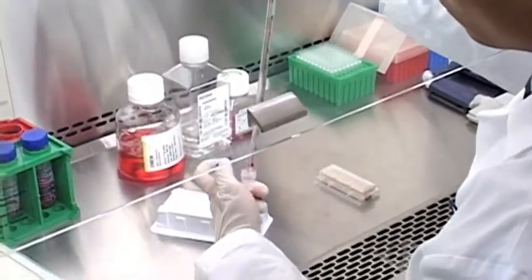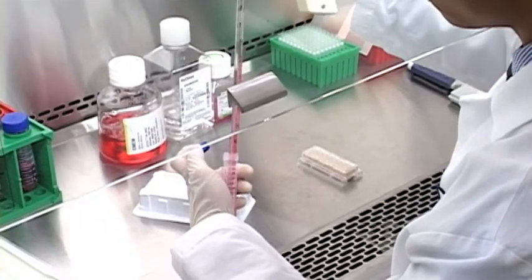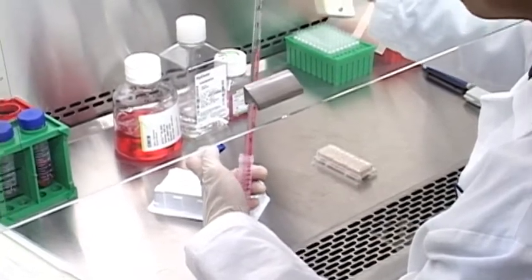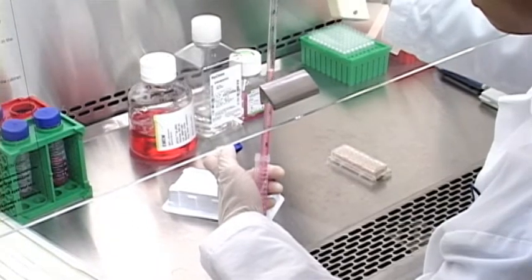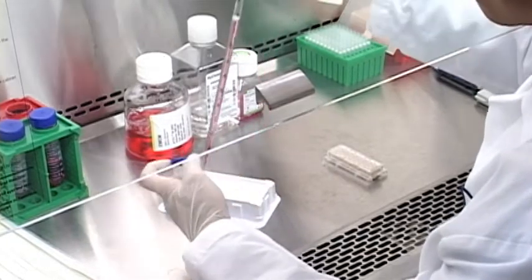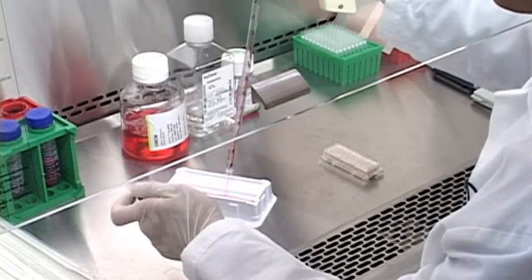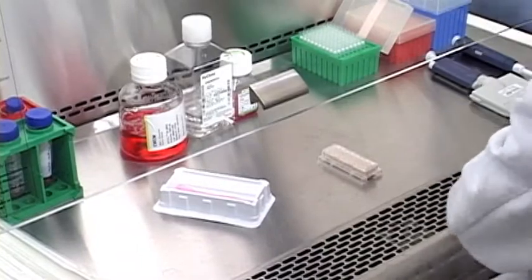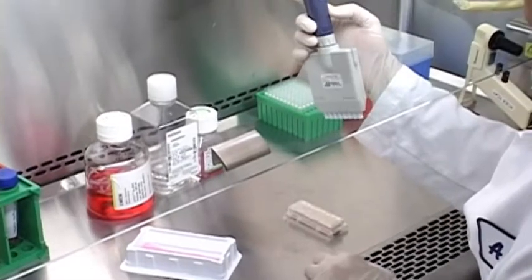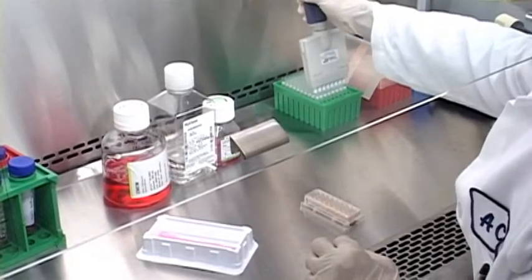And in general, you just want to make sure you have a nice homogeneous cell suspension, which entails pipetting up and down extensively. Since I have a P200 as a multi-channel, I'll just be pipetting 150 microliters twice. If you had a P1000, then it would be much easier, but whatever your preference is in terms of plating.